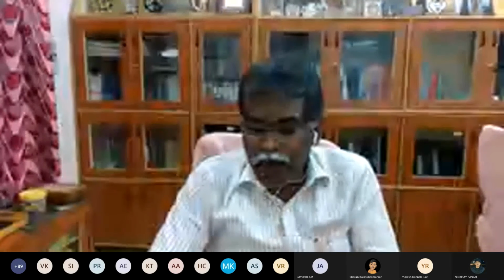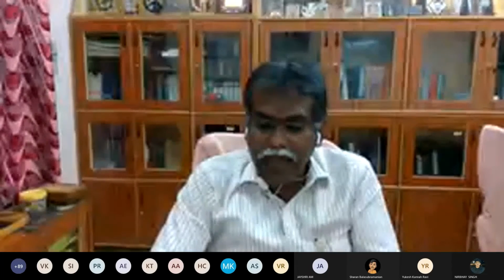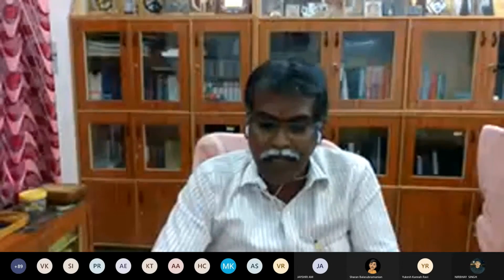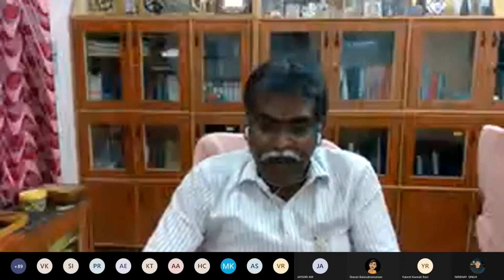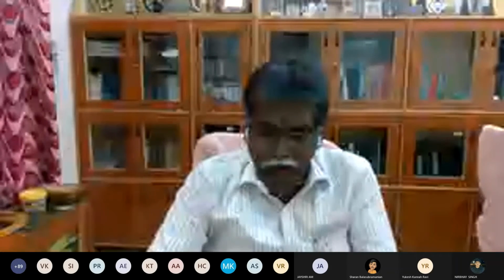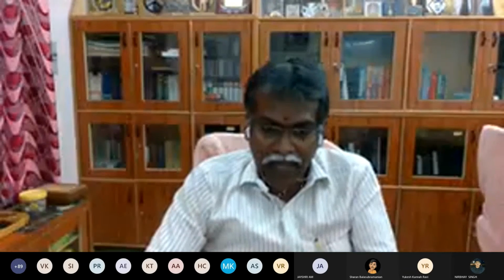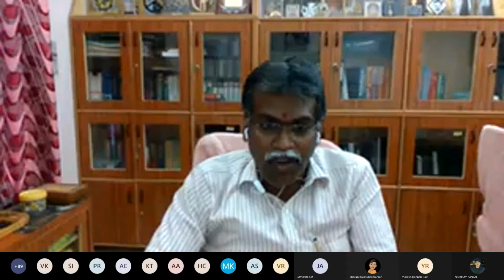This and all you would have studied in the last semester. Okay. So optimum coagulant dosage is measured in particular with the turbidity remaining in the water, or what is the efficiency of the turbidity removal. Okay, please make a note: turbidity measurement is used to determine the optimum coagulant dosage of the particular water or wastewater, and you can also evaluate the performance of water treatment plants by measuring simple turbidity value. So these are some of the significance of turbidity value.